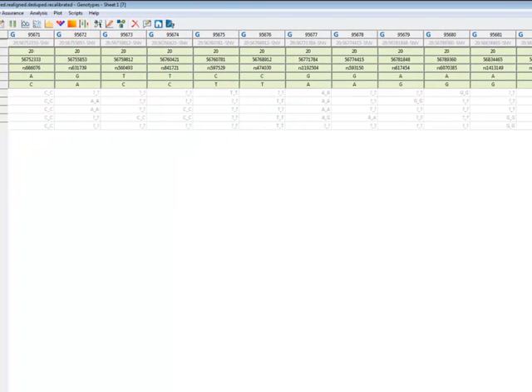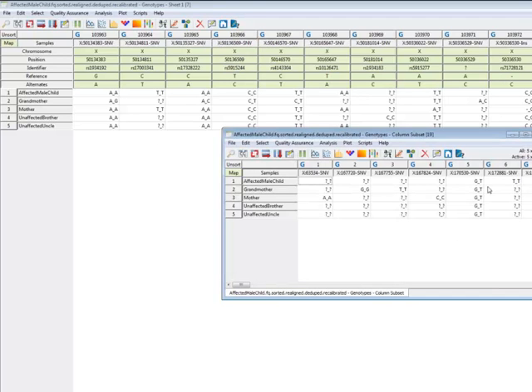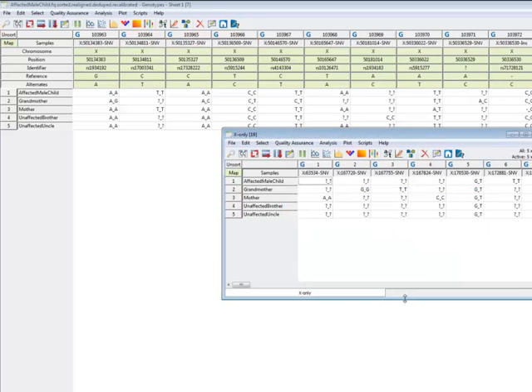You'll see as we go along that that idea of filtering based on either map position or based on external databases is something we'll use quite a bit. But now that I've reduced it just to the X chromosome, I'm going to rename this spreadsheet so I remember where we are here. I forgot to rename it on import, so it has that big long auto-generated name up here at the top based on the VCF file name. I should have adjusted that, but I didn't.